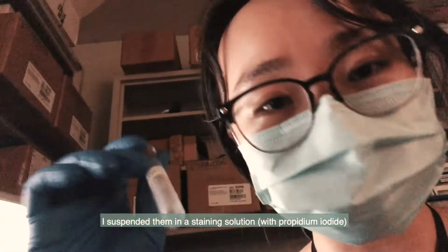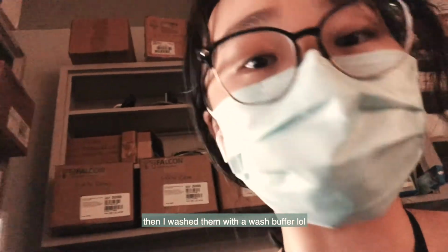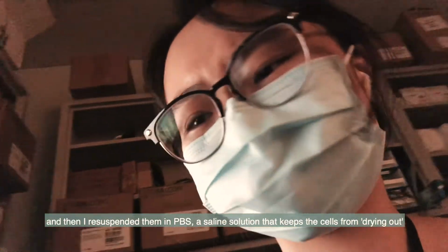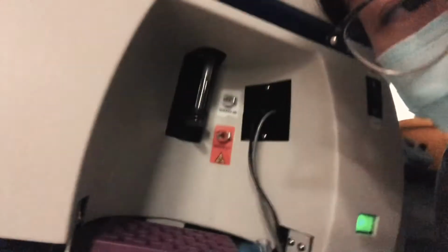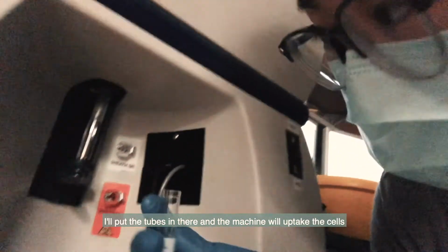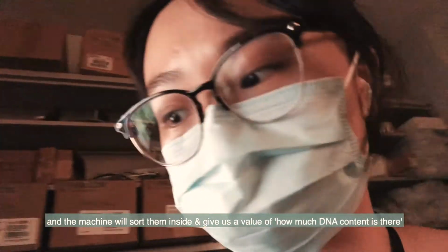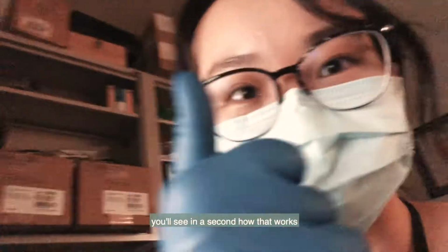And so I suspended them in a staining solution, and then I washed them in a wash buffer, and then I resuspended them in PBS, which is just a saline solution to keep the cells from drying out. And then what I will do is put them in here. You see where the tube is? I'll put them in there, and then the machine will uptake the cells and sort them inside and then give us a value of like, this is how much it's in there. And you'll see in a second how that works.